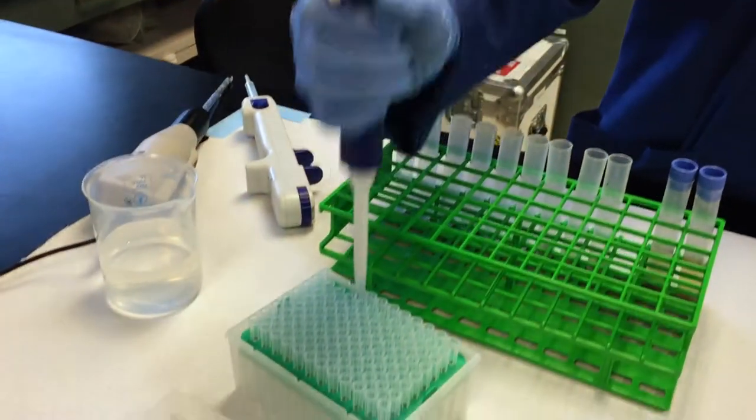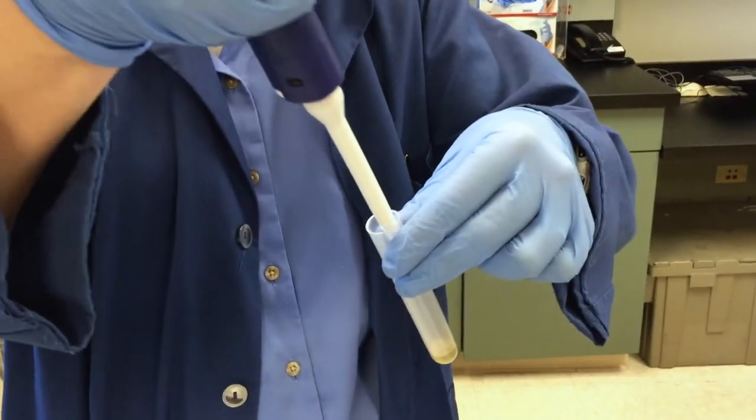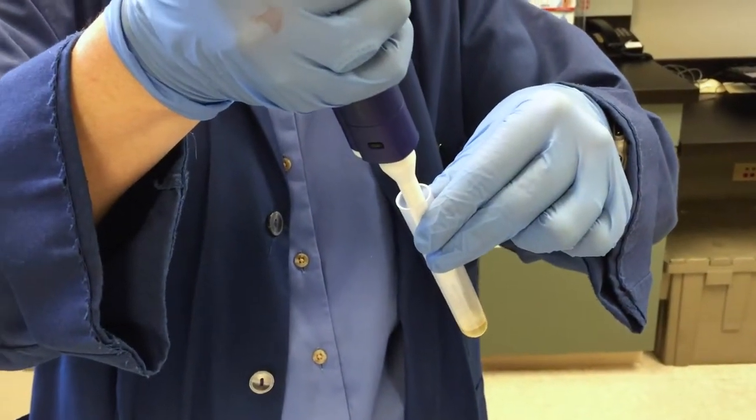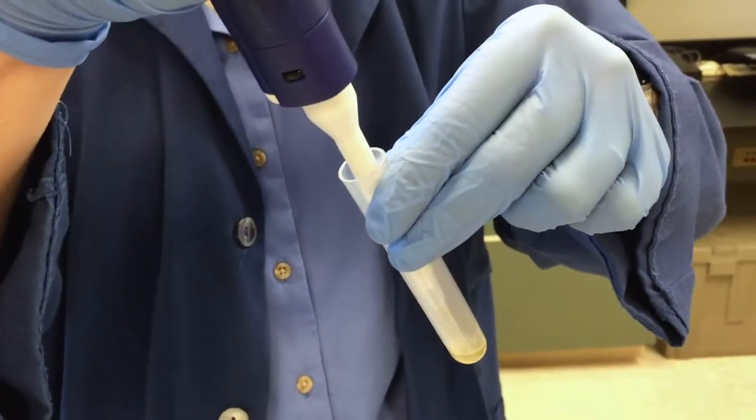I'm just going to demonstrate as that's pouring through. We would then take our pipetter and take out a certain amount of the liquid, which has the hormones in it, no longer the feces, and put it into our test tubes here. We do everything in duplicate.